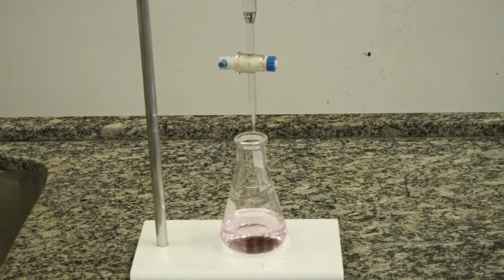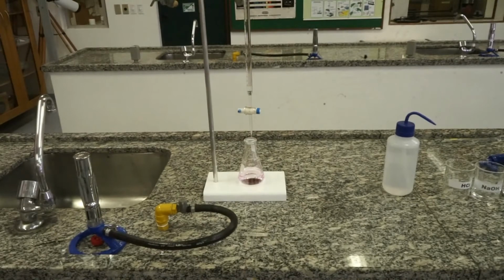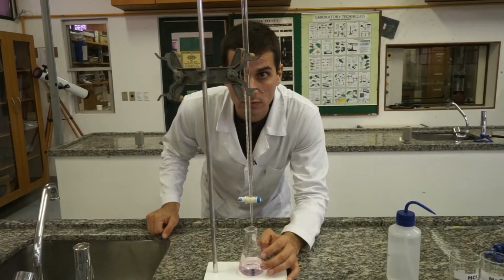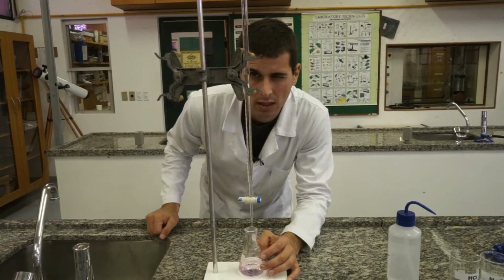Now I have to read the burette to see how many milliliters of titrant have been added to neutralize the ANALYTE. 27.9.